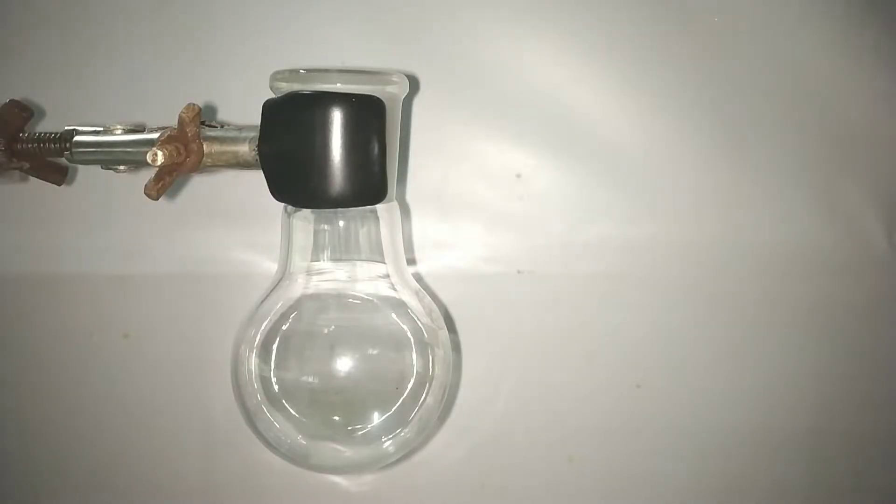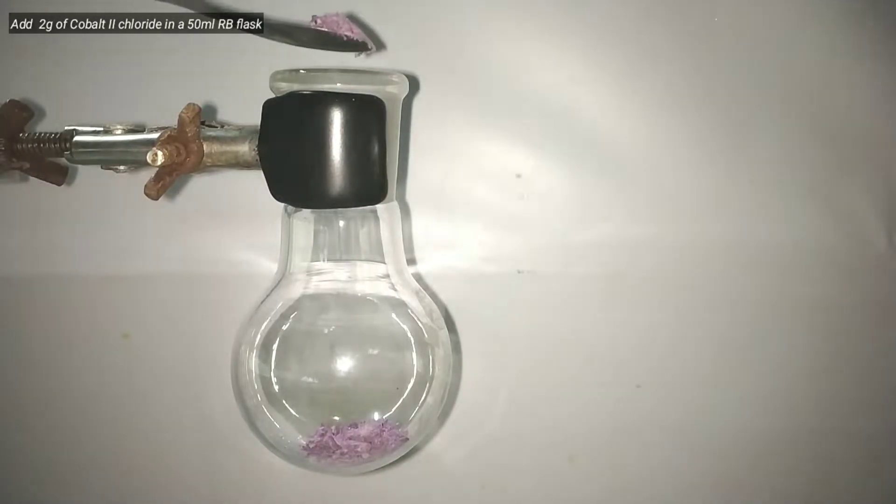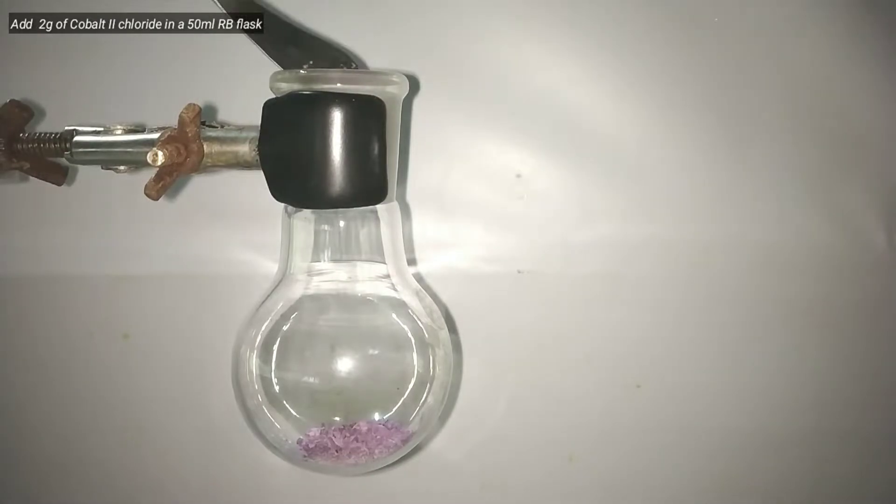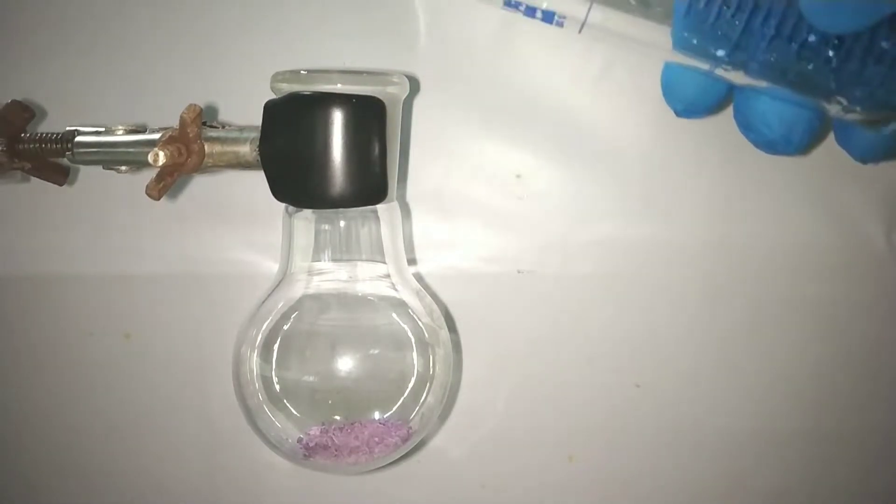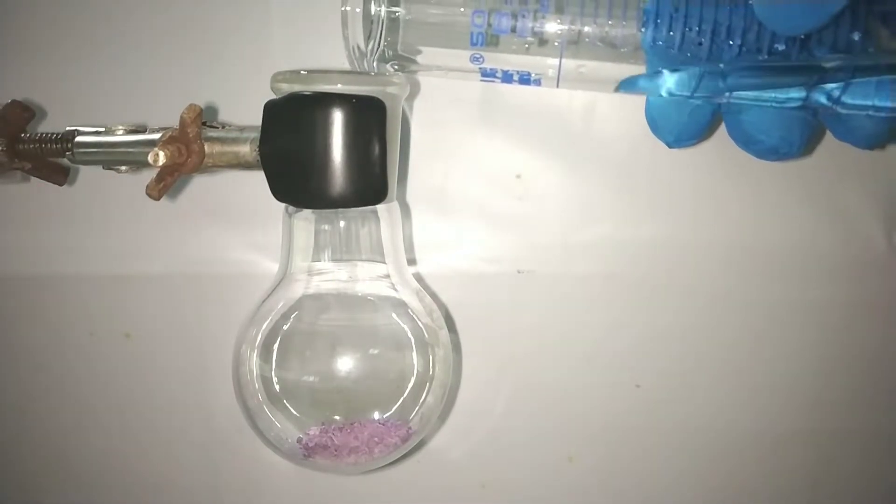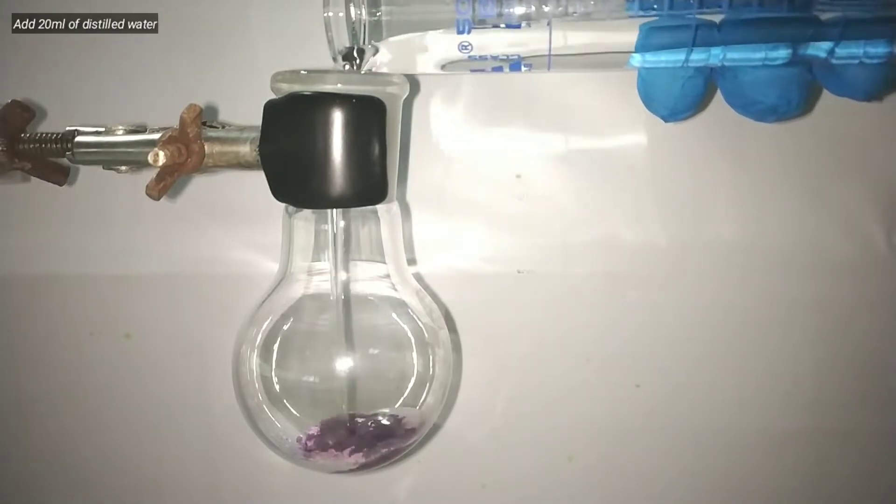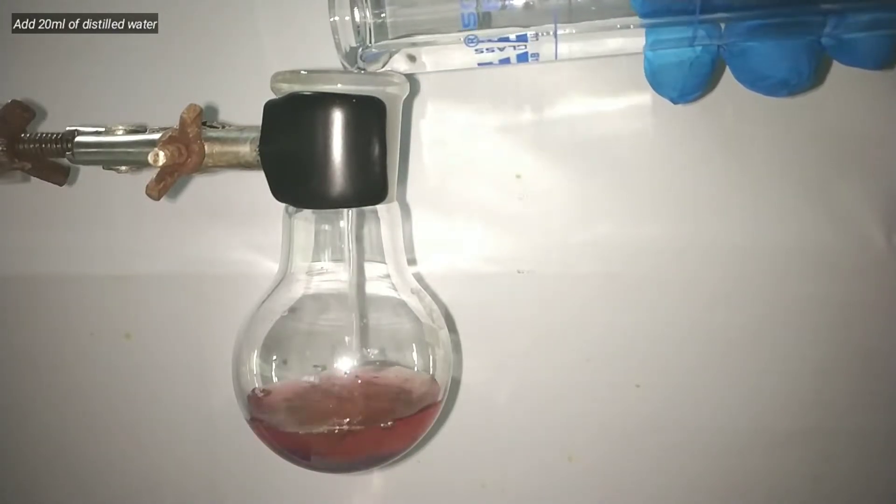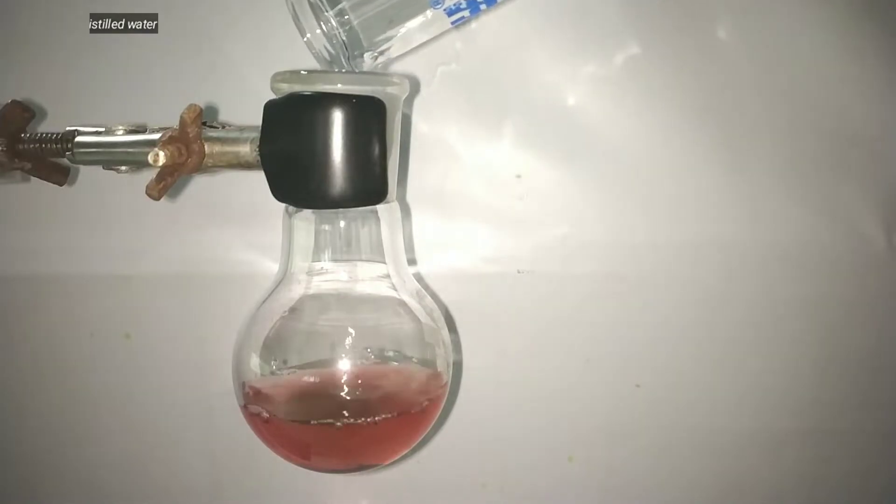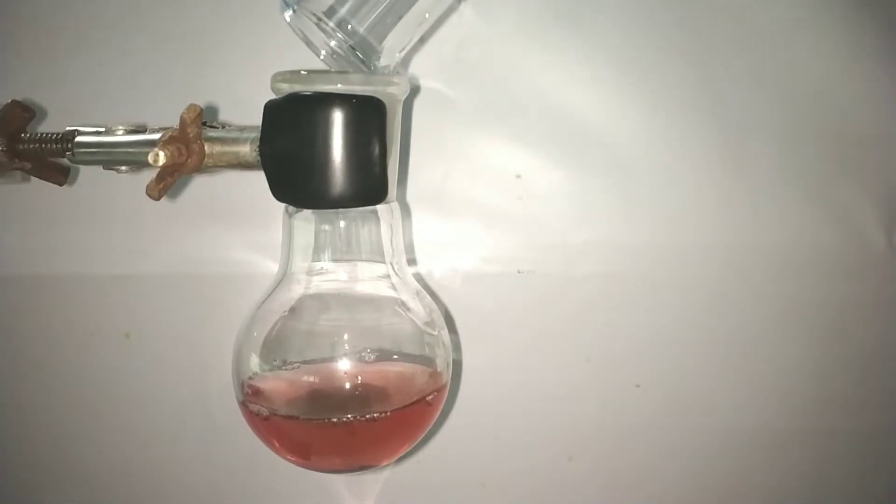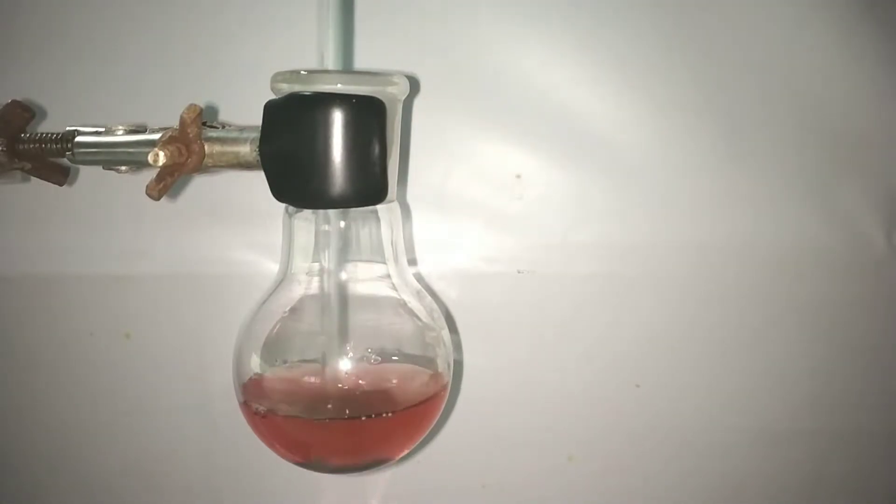Start by taking a small 50 ml round bottom flask and add 2 g of cobalt(II) chloride into it. Now add 20 ml of distilled water into it to dissolve the salt. The solubility of the compound in water is very high, so it dissolves easily giving a red colored solution. With a glass stirring rod, dissolve the compound in it.